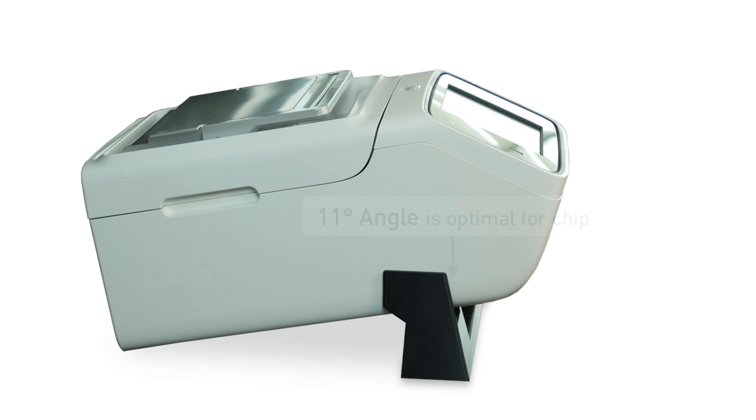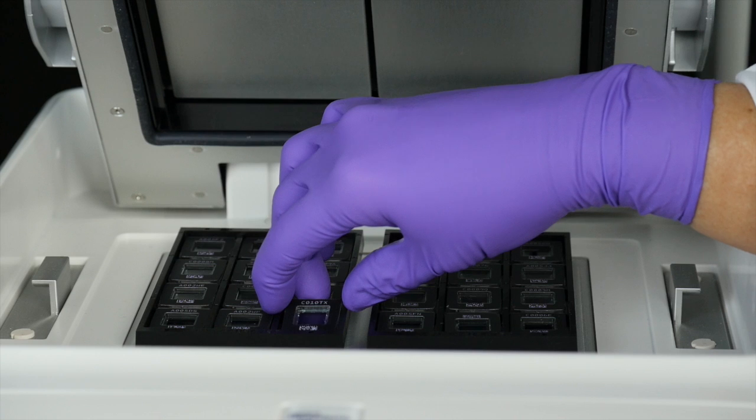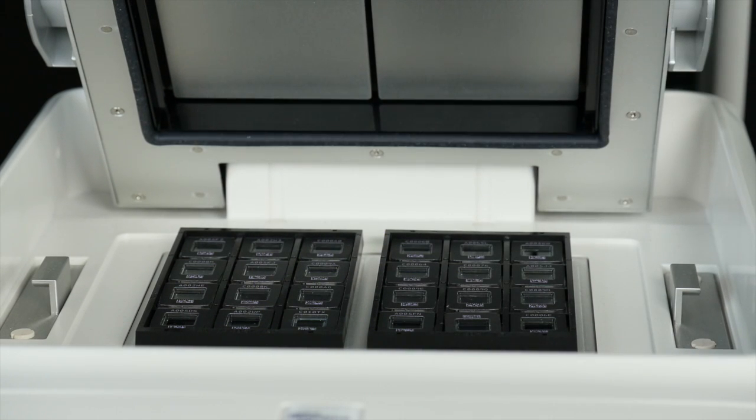To prepare the dual flat block thermal cycler, insert the tilt base under the front of the instrument. This ensures an optimal 11 degree tilt of the chips towards the bubble management area during thermal cycling. Also, remember that chips should be placed so that the chip IDs face the front of the thermal cycler.